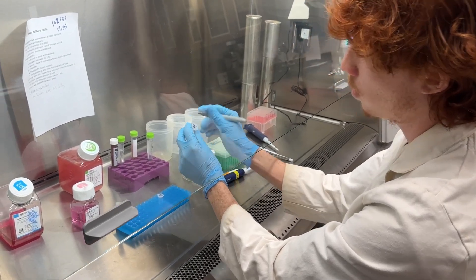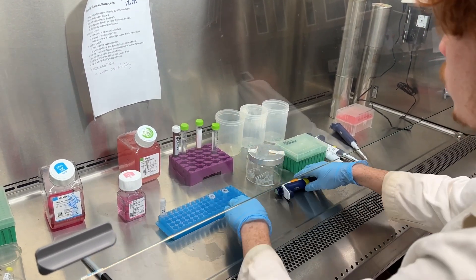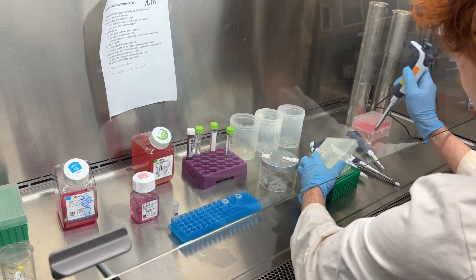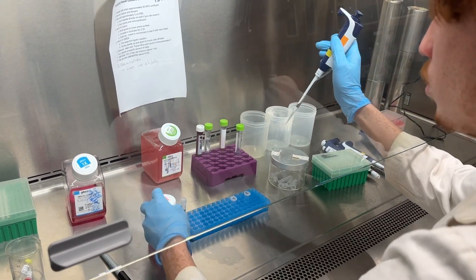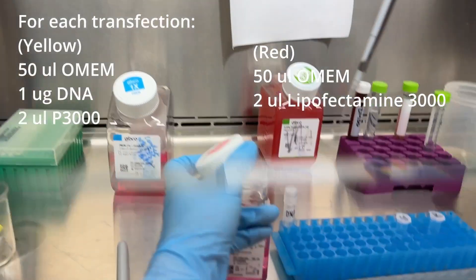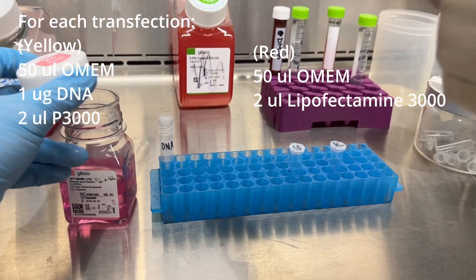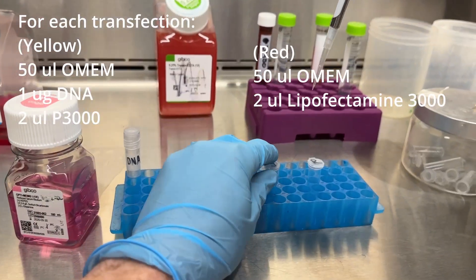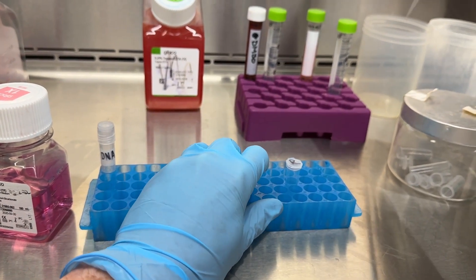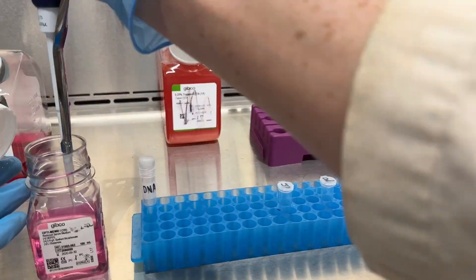For each transfection you're going to need two tubes. Spencer has labeled each tube as R and Y — we'll talk about why those labels in a moment. Into each tube he places 50 microliters of OMEM, an optimized medium — think of it as SOC for human cells. Then into the yellow tube he adds the DNA and the P3000 reagent.